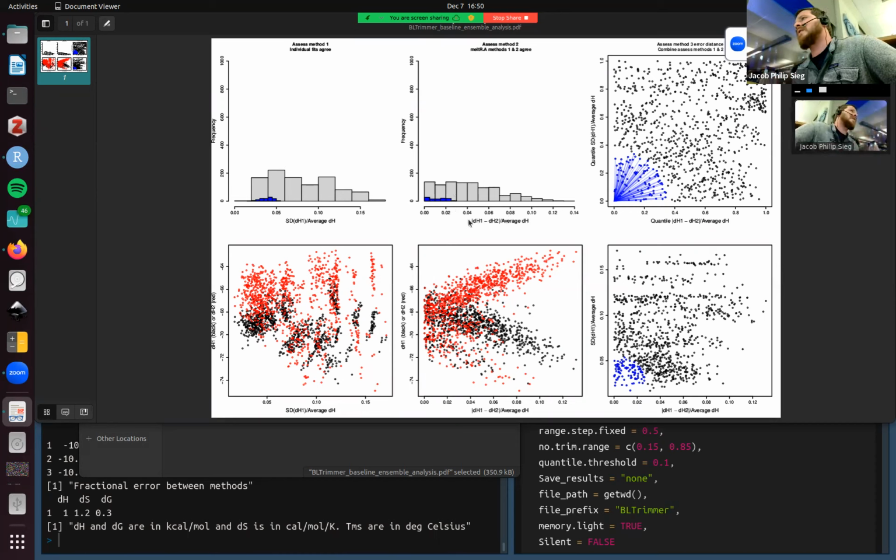There is a positive control that we describe in the manual, that is a non-two-state melting sequence. And if you need to change the baseline trimming parameters, you can use that positive control and look at this distribution on the non-two-state sequence, and it will peak at about 15%, indicating that it's non-two-state.